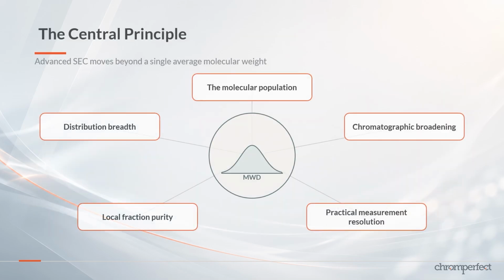Calculated molecular weight calibration plots show how corrected averages vary through the chromatogram. They can reveal local polydispersity, support fraction boundary selection, and help assess whether the selected column sigma value is physically plausible. Chromperfect can also support preparative fractionation by using cumulative weight fraction to divide a broad polymer into approximately equal mass slices. Repeated fractionation can produce narrow standards, although material yield decreases with every stage.